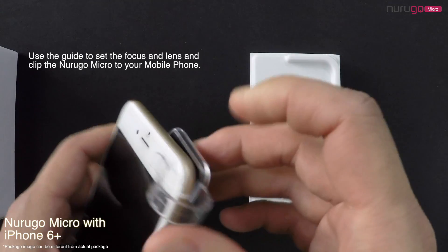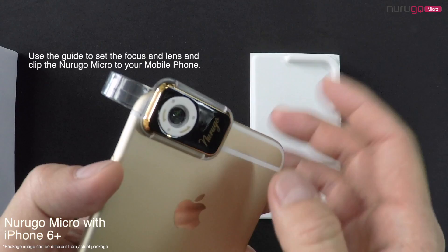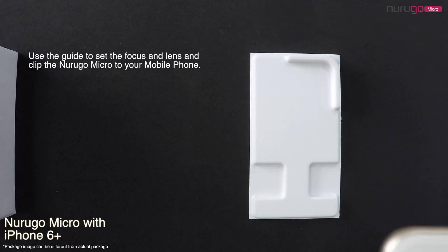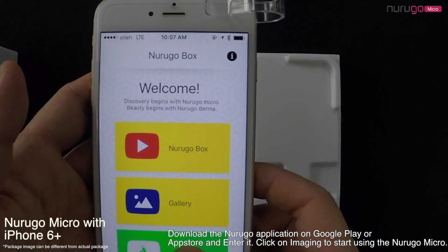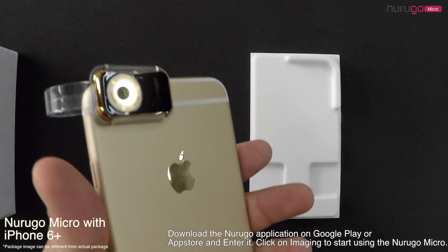Use the guide to set the focus and lens and clip the NeuroGo Micro to your mobile phone. Download the NeuroGo application on Google Play or App Store and enter it. Click on Imaging to start using the NeuroGo Micro.